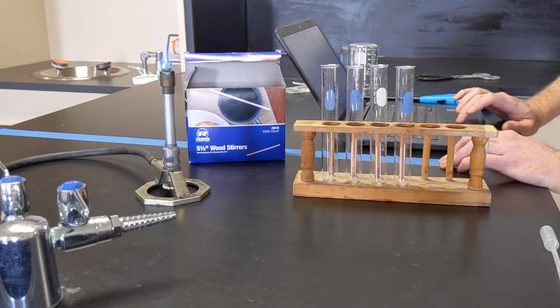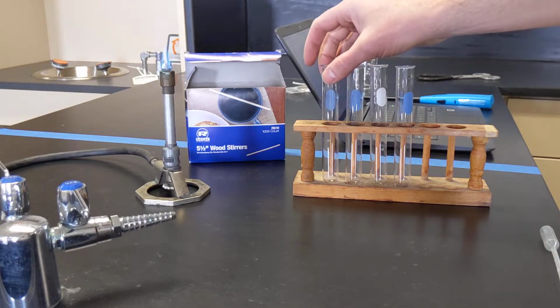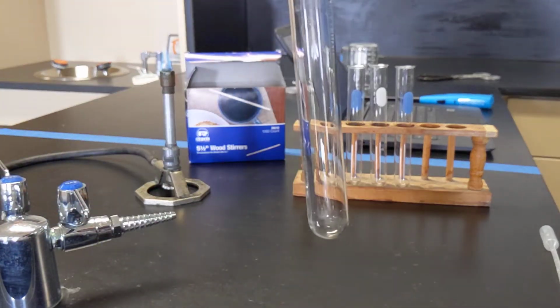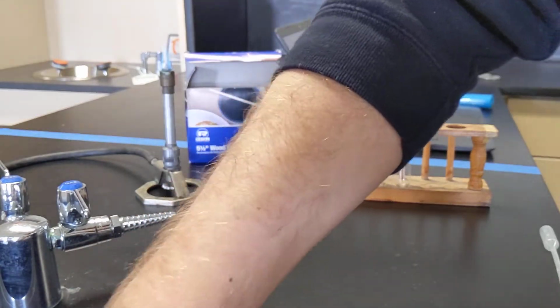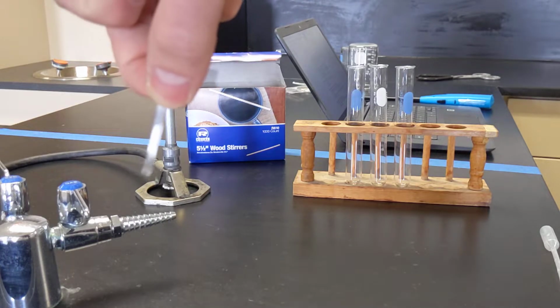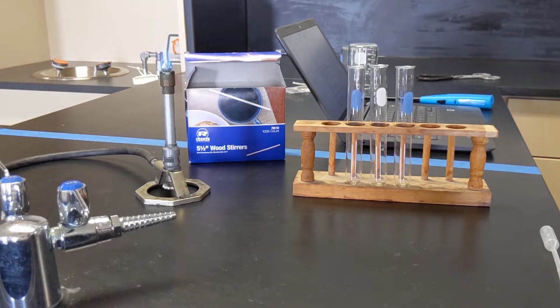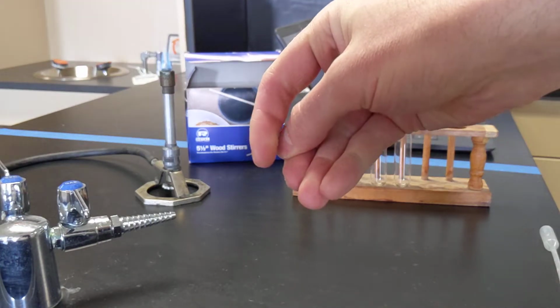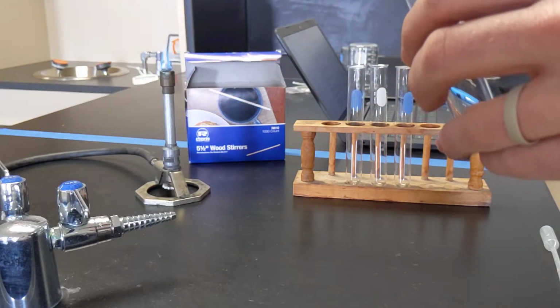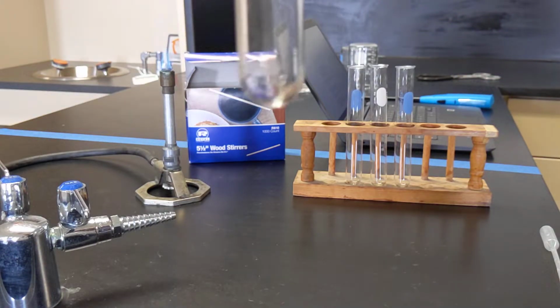Okay, reaction two is the reaction of magnesium metal with hydrochloric acid. These will be taking place in the test tubes here. We'll just go from left to right. So test tube, it's clean, there's nothing in it, relatively clean at least. Magnesium metal comes in a variety of forms. The form I'll be using today is a magnesium strip. It's just a thin piece of magnesium. It's silver, it's shiny, just like you would expect from any metal. So I'll crumple that into a ball, throw it in the test tube here. Glad it's at the bottom.